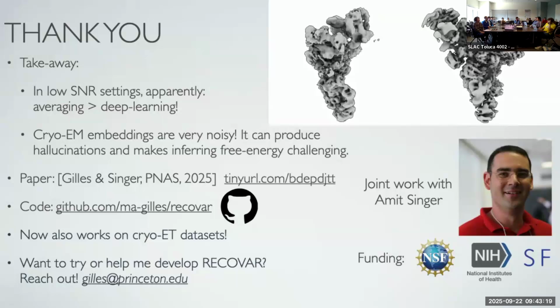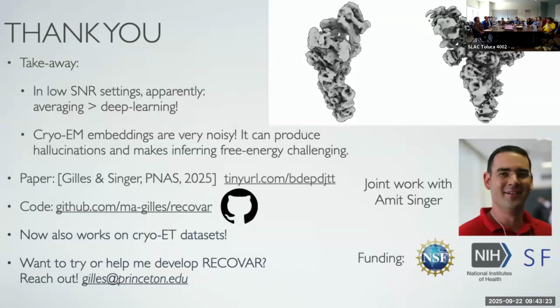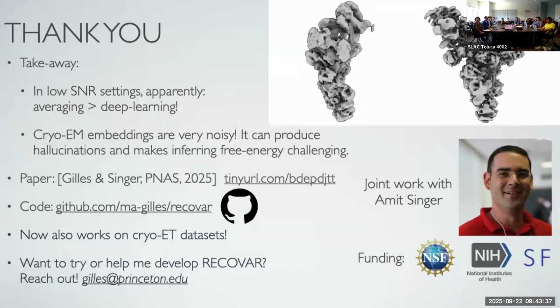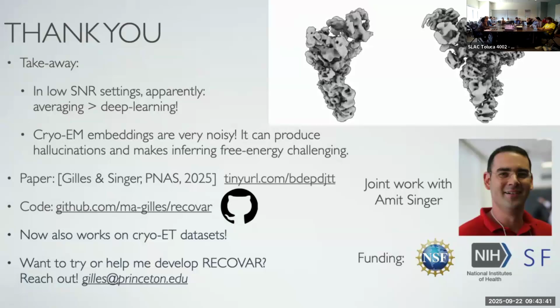One more question. I have a question about the correlation between experimental data and the method of preparation. Of course, a lot of cryo-EM data are collected at low temperatures and a lot at warmer temperatures. You're working more on the computational side, but in your experience, do you see a large effect of path dependence, in terms of cooling methods or how the sample is prepared, on the conformational ensembles that you see?